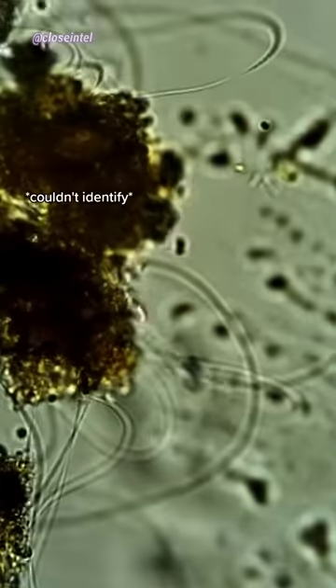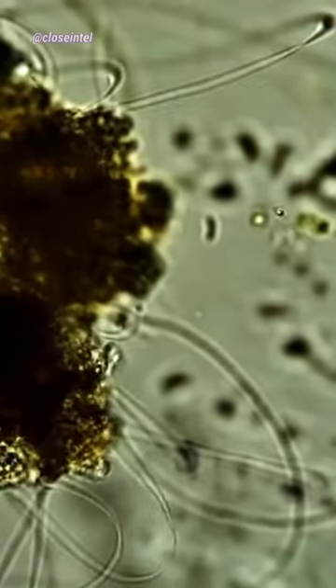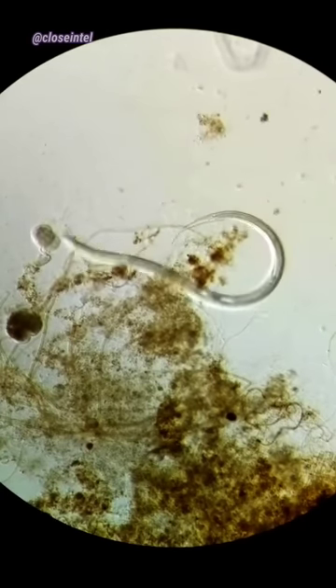There are also a bunch of these little spinning bacteria that died shortly after being exposed to the vinegar. This happens because of the acid in vinegar called acetic acid, which removes the moisture from their bodies, destroying their cellular structure.